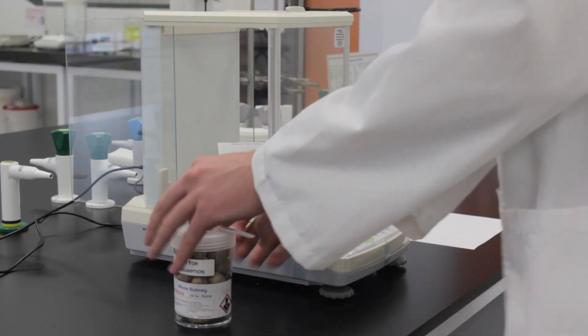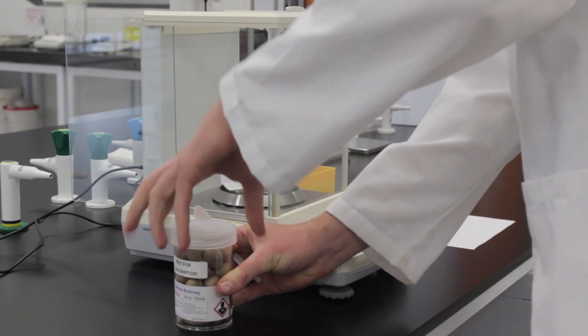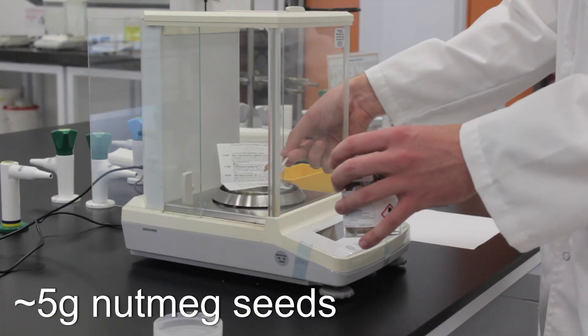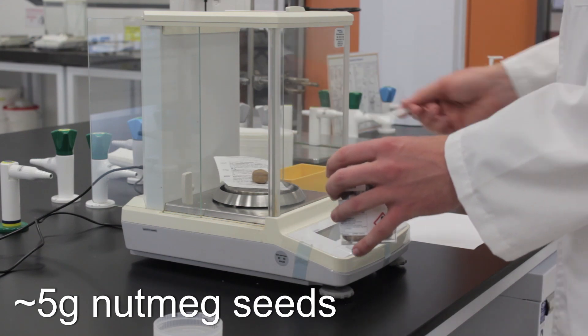First we need to grind up our nutmeg to allow for easier chemical extraction. Weigh out about 5 grams of whole nutmeg seeds on the mass balance. You should need about one or two seeds.